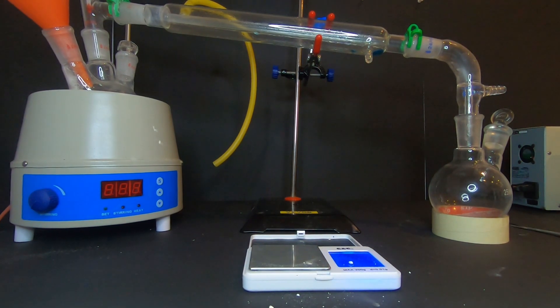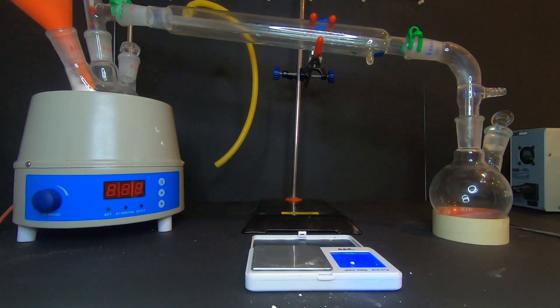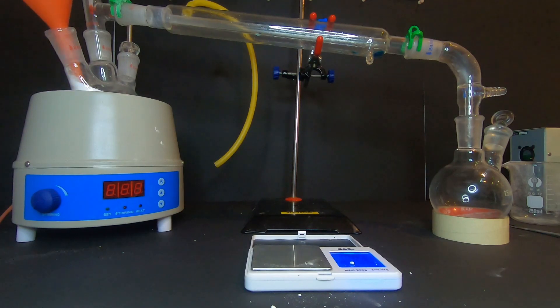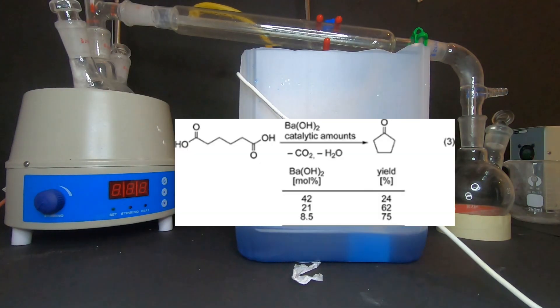I had some struggle putting the mixture into the boiling flask. The temperature must be 250 to 300 degrees Celsius for the reaction to begin.